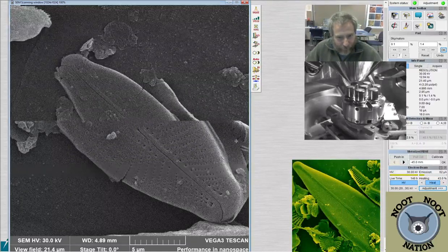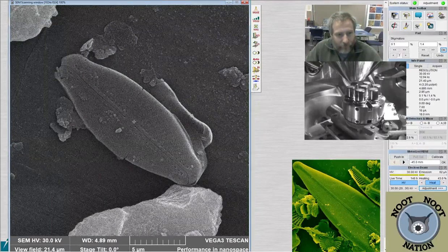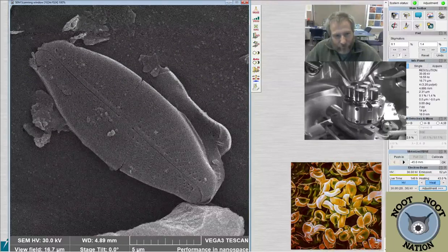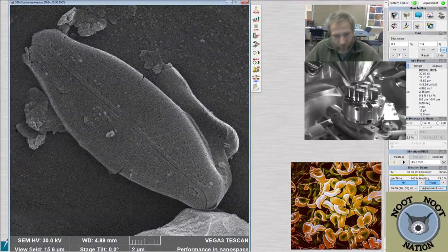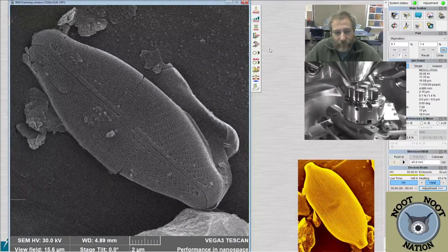If that is part of the valve back here, it's got a little silica platform. So I'm going to try to incorporate that in my image. Because that looks like it's part of this diatom, which means that is Sellaphora for sure. Take that, Anna. I got it right.